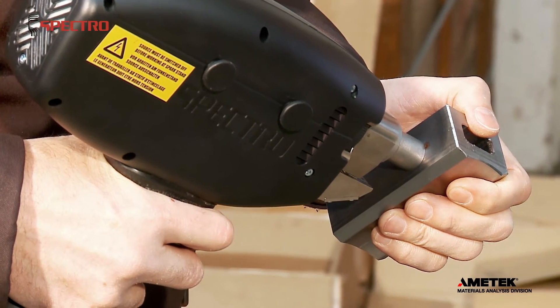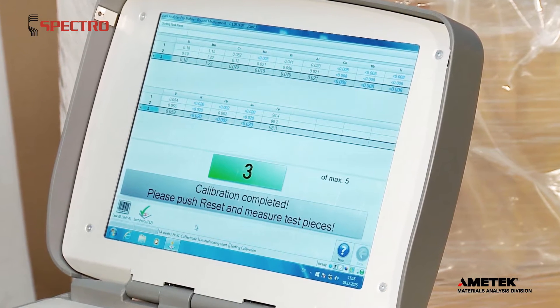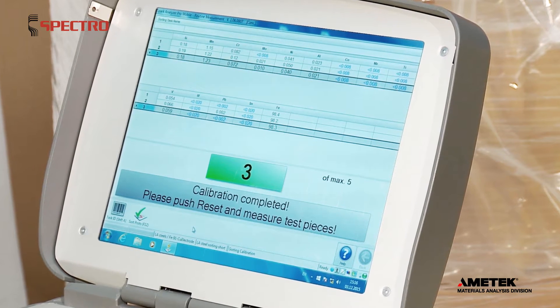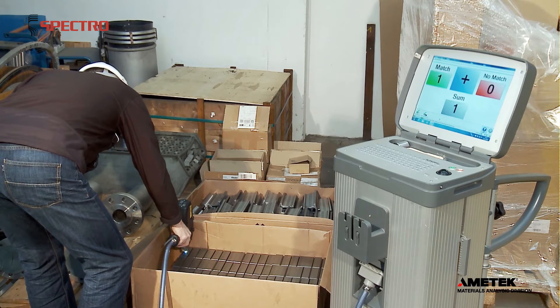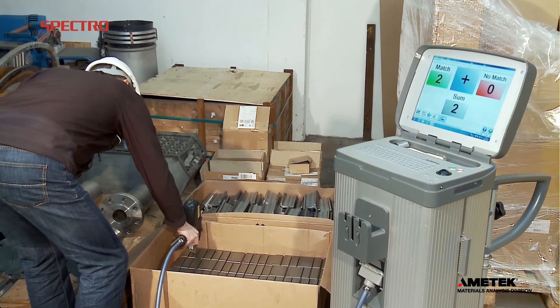You measure a reference piece from the lot three times, and its average intensity values are stored. Elemental concentrations are not of interest in pass-fail sorting, and sample preparation can usually be avoided, which makes for relatively quick testing, as long as each piece has the same surface conditions.